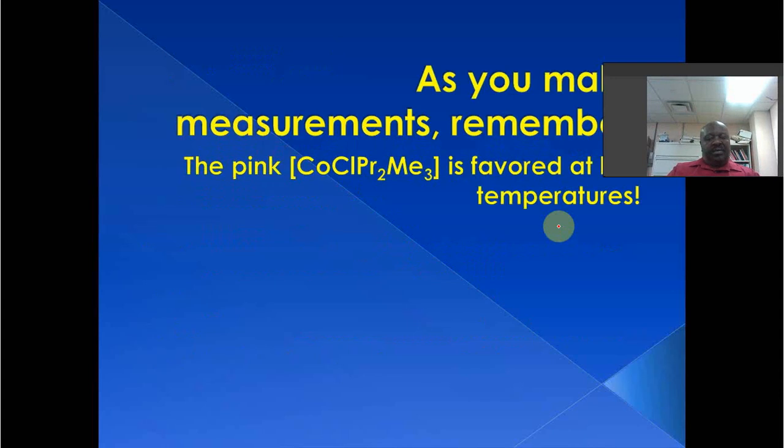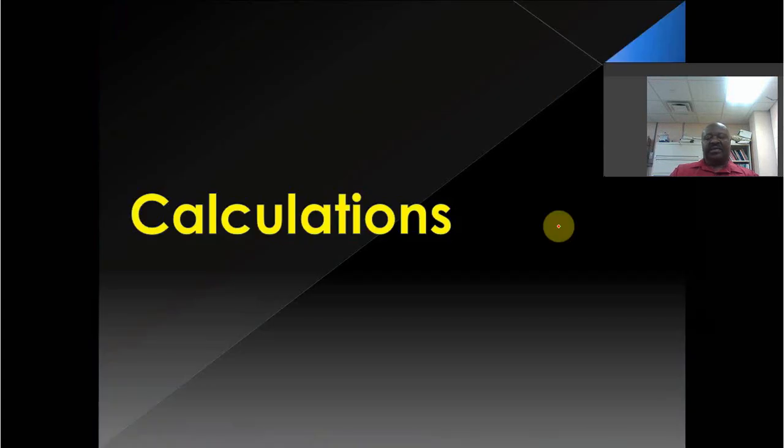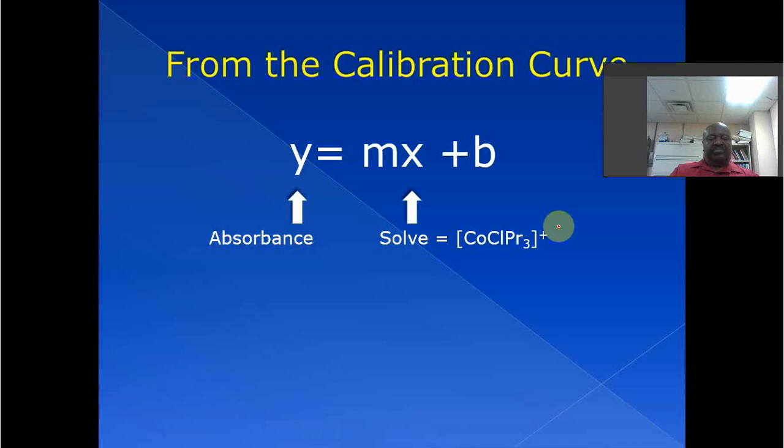So that's all up today. Watch out for these solvents. We don't want methanol or propanol or whatever entering in anybody's eyes and skin or whatever it is. So again, watch out for that.